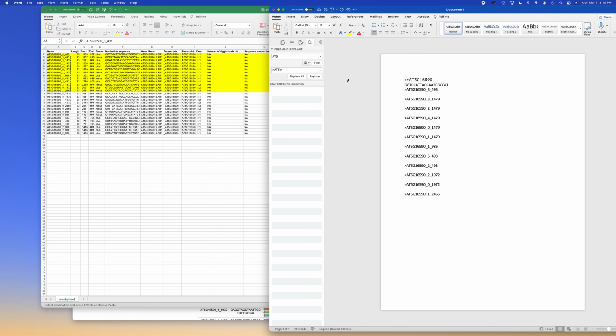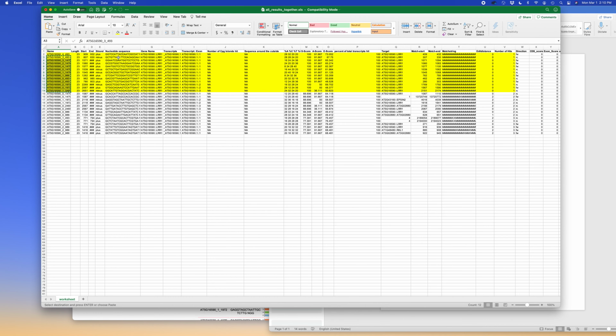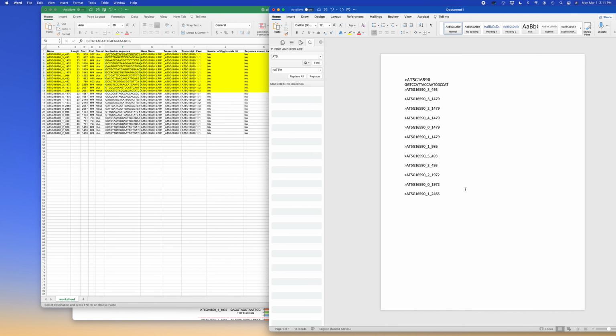Now that's a mistake. Fix that. And now we just copy the sequence going down the list. Actually, I'm going to copy all but the first one.